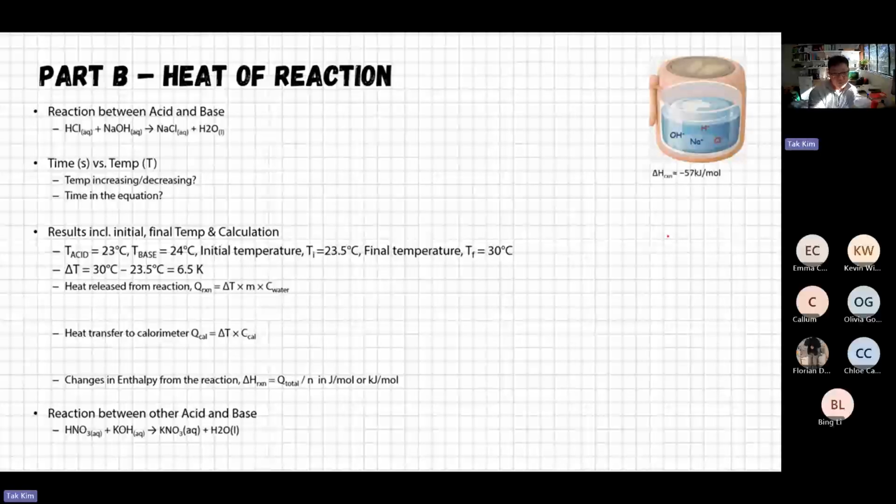Anyway, based on what you guys did, these are the reagents you are using, and the concentration of each one was say 1 molar: 1 molar HCl and 1 molar sodium hydroxide solution. These are the ones you have in your solution. But as soon as you mix them together, acid or proton and OH minus, they will start reacting.